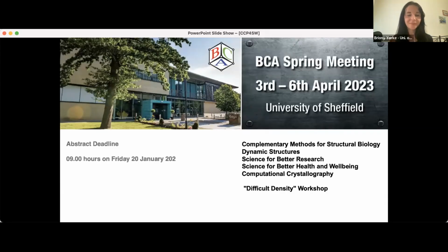Yes, hello, Briony. Gérard Bricogne. I made a comment many years ago when you first published this Hadamard method, that in the example you give with the weighing of objects by pairs, what is assumed here is that when you weigh several objects at the same time, you have the same error, and that these errors are distributed. Now, if you look at the classical papers on weighing schemes, this is what is assumed.